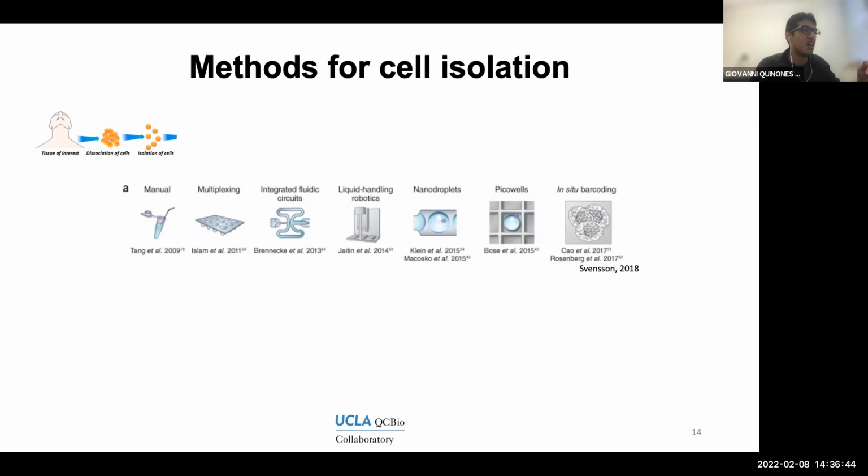because pretty much all the molecules within a cell will have attached to them this label, and this label indicates, hey, this RNA molecule comes from this particular cell. And of course, as you can imagine, this is a simpler approach and very high throughput. The advantage is that they're able to, this way, isolate hundreds of thousands of cells very easily.